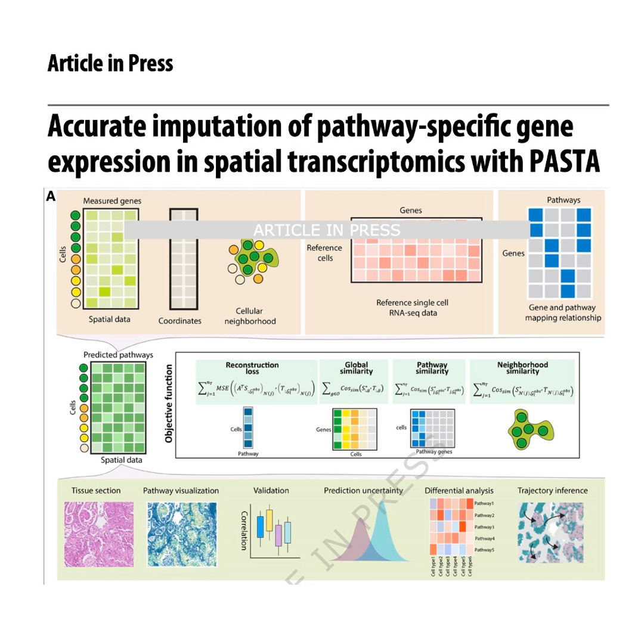They used a clustering tool called IRIS, which is designed to spatially segment tissue into meaningful domains. And when they clustered the tissue using PASTA's imputed pathways instead of noisy single genes, they got a much, much finer separation of these domains. So what does that mean in practice?